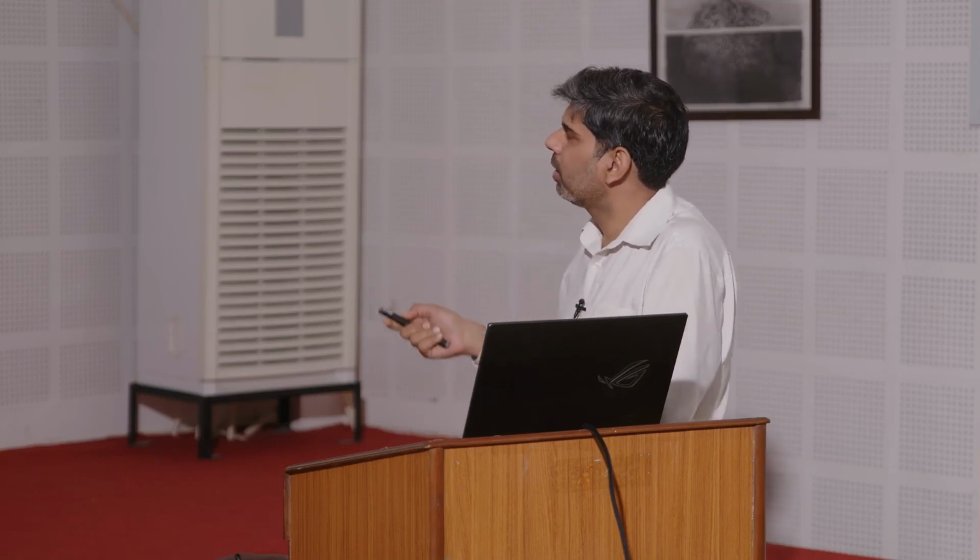Our goal is that we want to have as good separation as possible, and what you can do on a microfluidic chip is that, here I am showing only 2 peaks, but you can actually separate a very large number of peaks. This is taken from a paper where they use microchip electrophoresis for DNA sequencing on a microfluidic device.